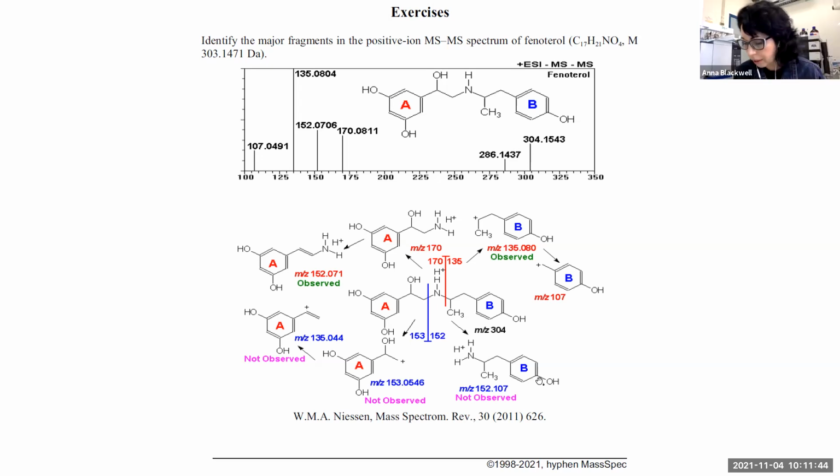And you think that my explanation about lost ammonium, it's unreal? Of course, you can say that from the 170, you say I see the water loss, so I get this one, and I would have the loss of ammonia from there, which basically would mean that the ion you get is this.